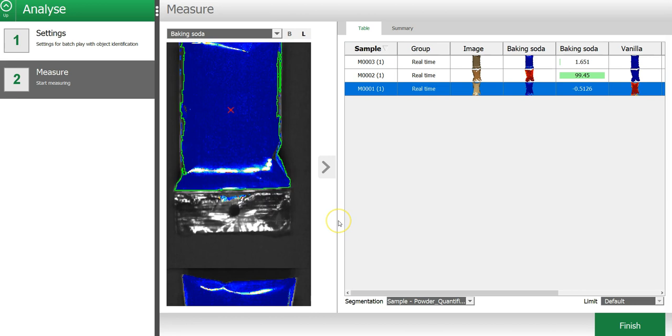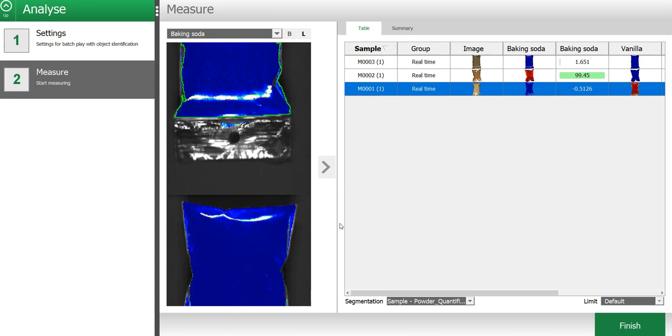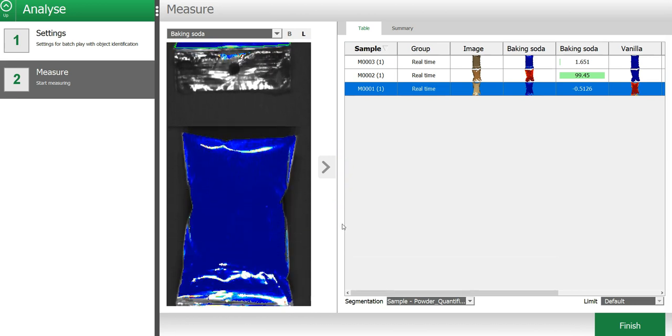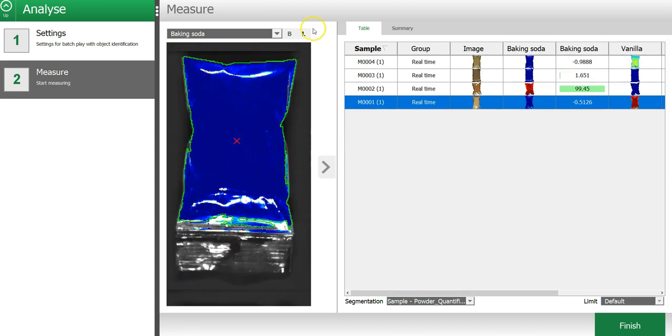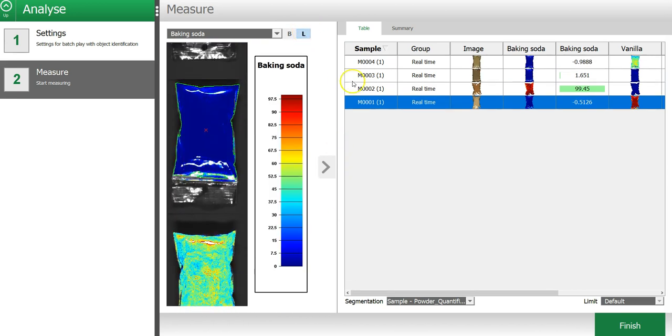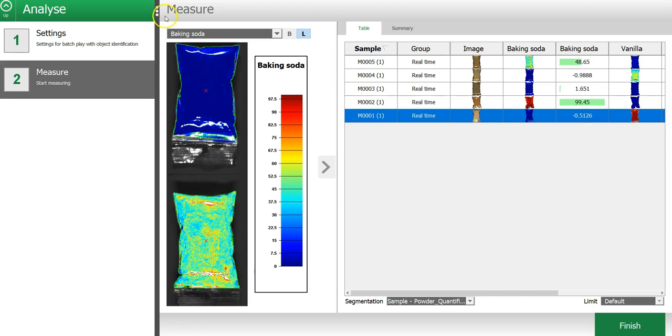As you can see, the images are analyzed in real time and the results are displayed in the table.